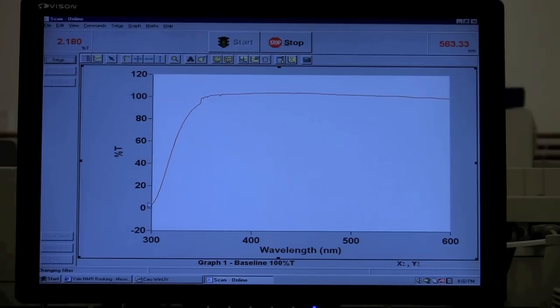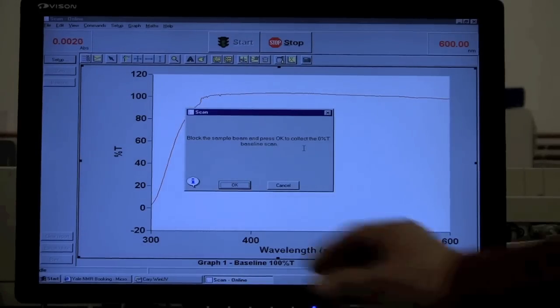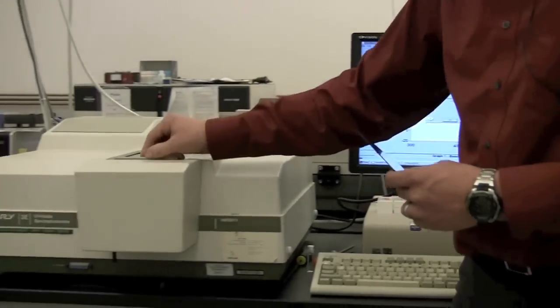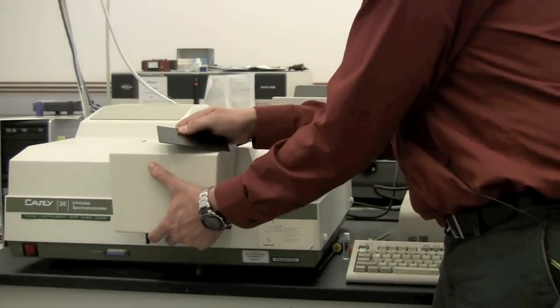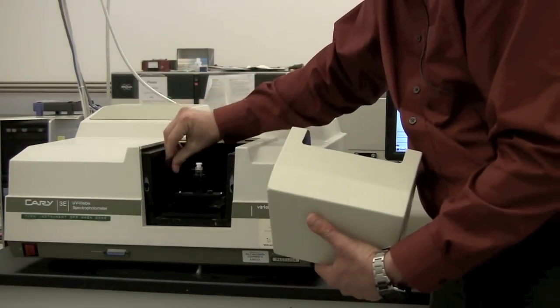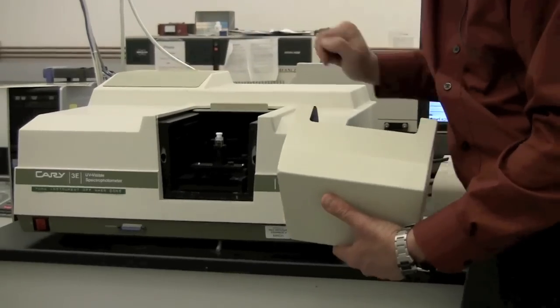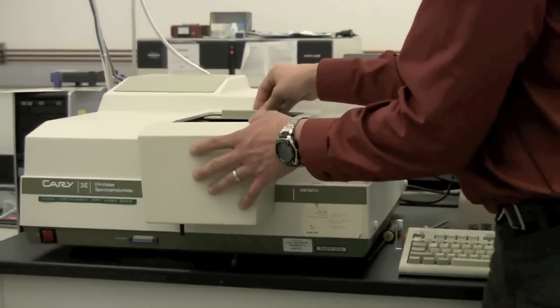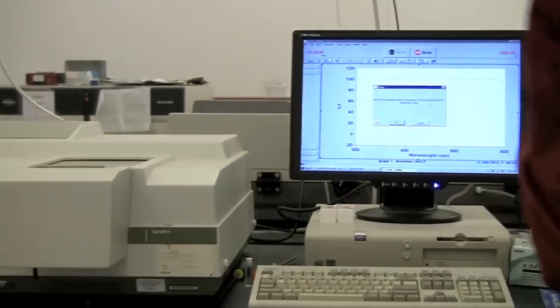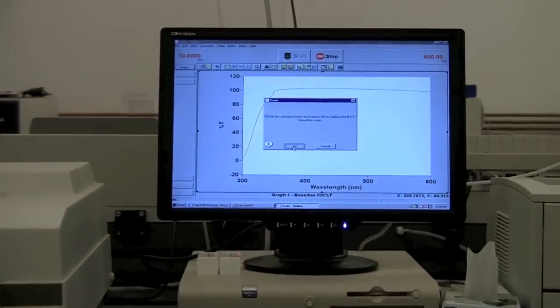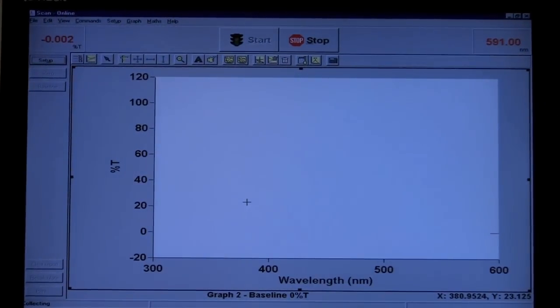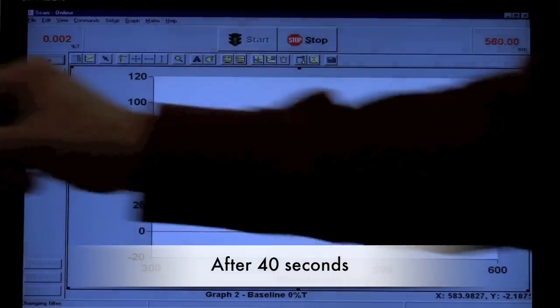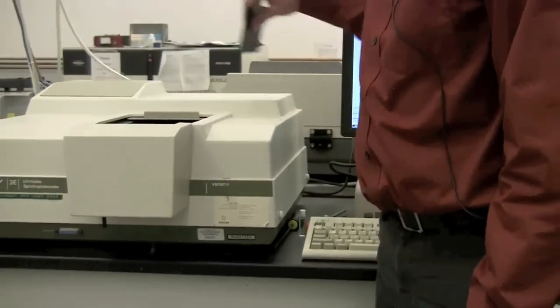That's one reason to collect a baseline. So now it says block the sample beam and press OK to collect the zero percent. So we can use this plate here to block the sample beam. What you want to do is put it in line so that none of the light comes through. Click OK, and you should be collecting basically zero.